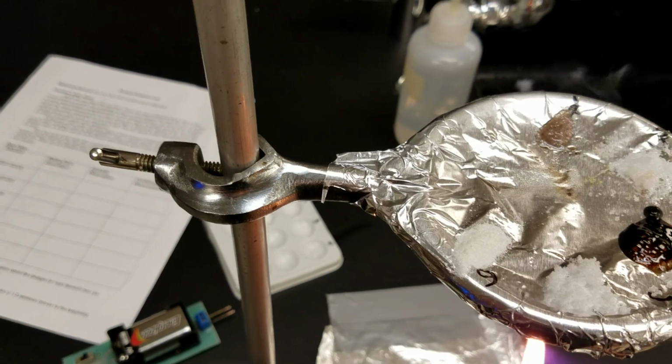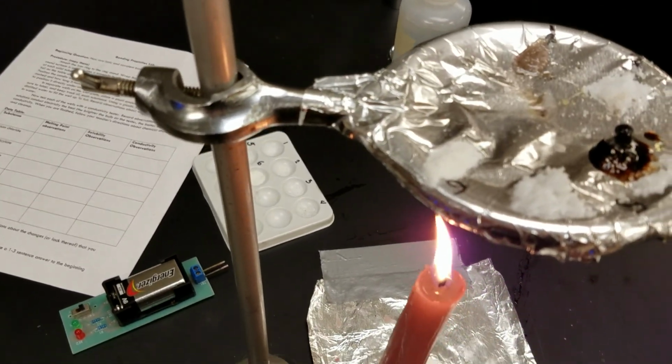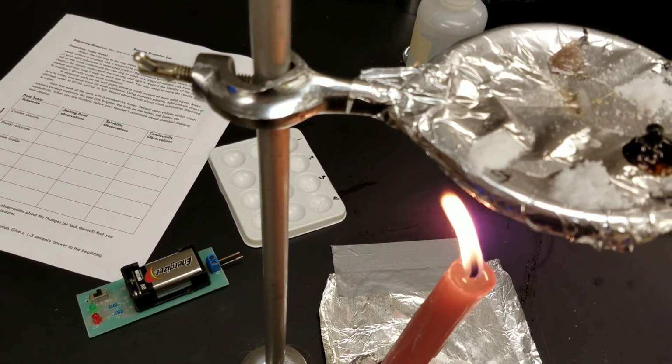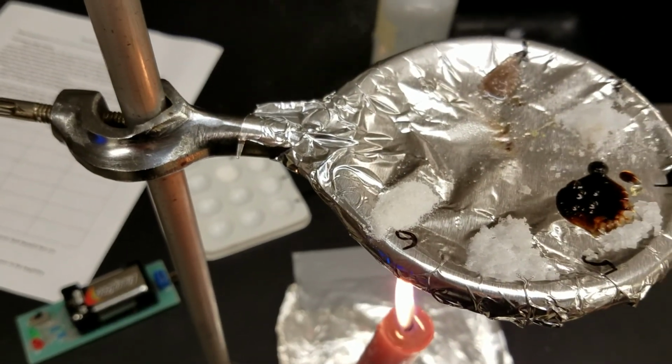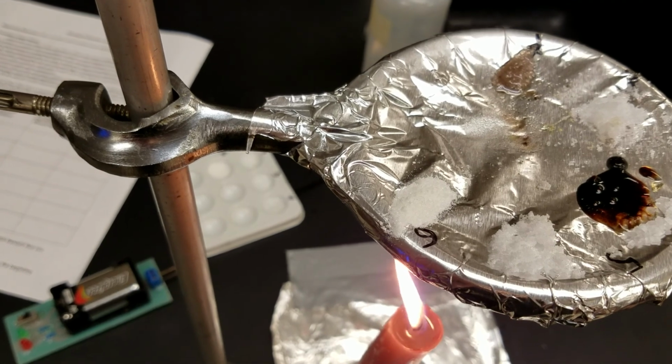So we'll go to the last one, ascorbic acid, which is vitamin C. Move that just under number 6. And we'll watch to see if it does anything.